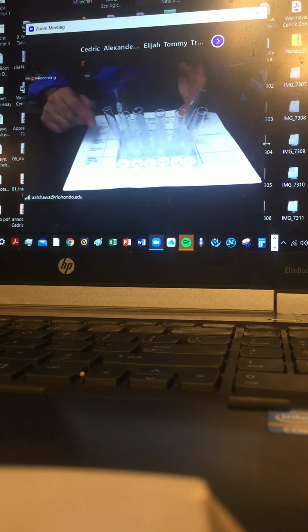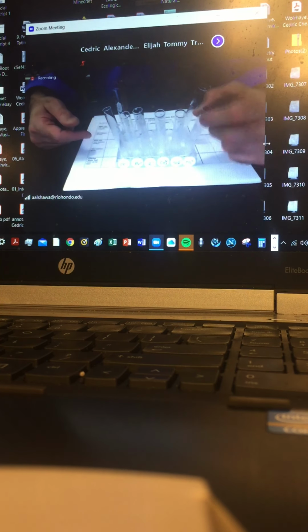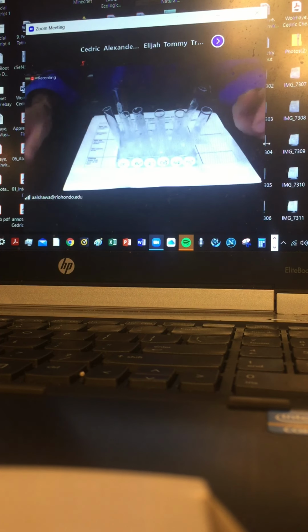Well, typically, based on the previous tests, remember the silver nitrate test exposes the phosphate. So silver phosphate has a unique hint of yellow in the background of that solid that makes it so unique. Okay, so you start with the silver test and look for that color first.